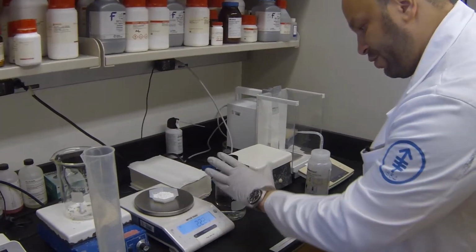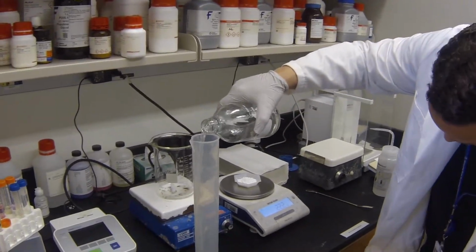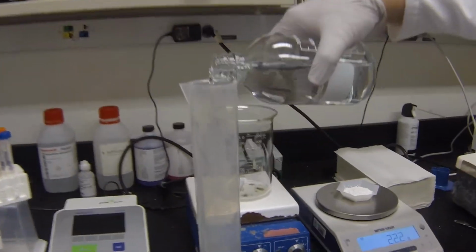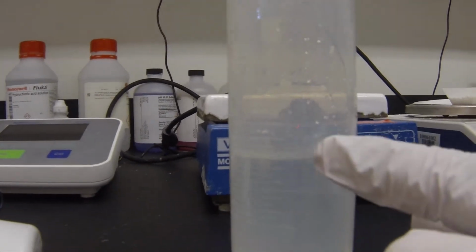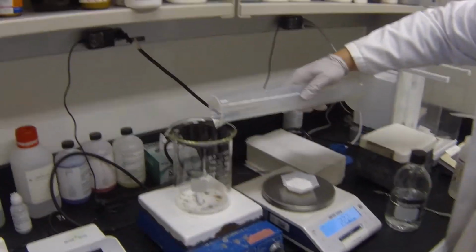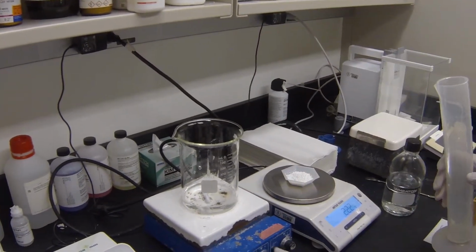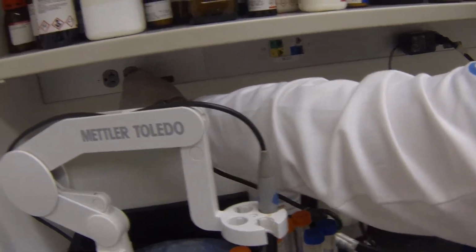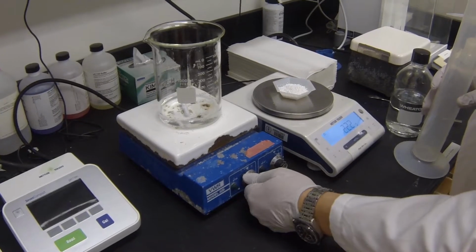Now that we have our calcium chloride weighed out, we're going to measure out 100 mils of solution. We got our graduated cylinder, and we're going to get it right at 100. You see right there, we got 100 mils of solution. Pretty good, not bad. We're going to pour it right into our beaker, want to get it all in there, and then we're going to start getting our magnetic stir bar in action. Here, let's plug it in, and now we're going to see if it's working.